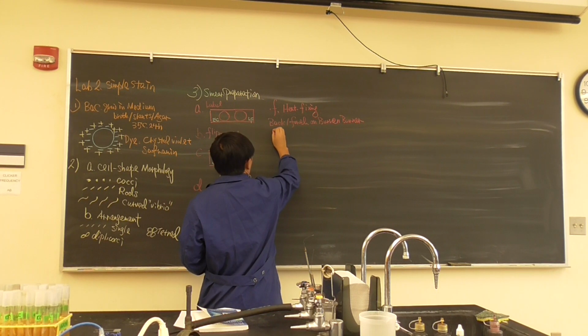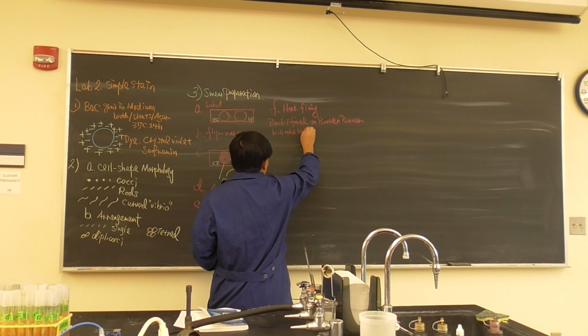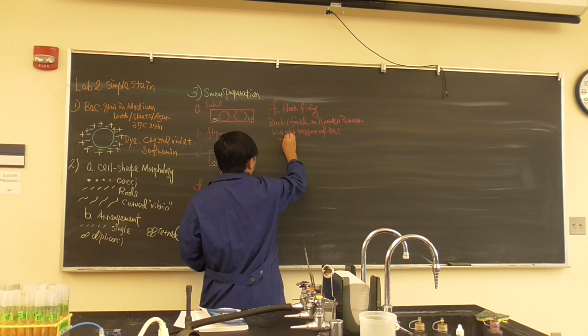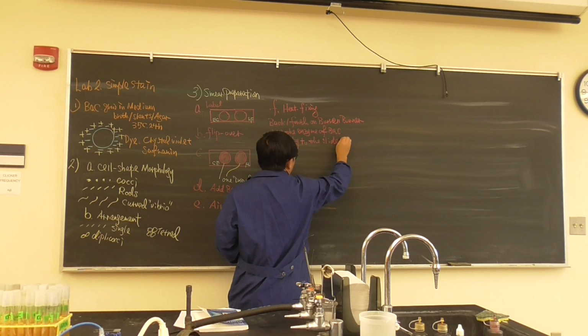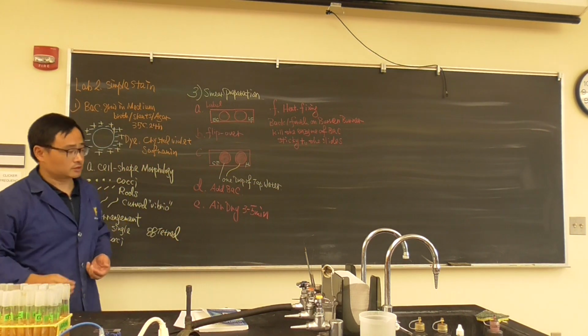We're going to have to kill the enzyme or bacteria and make them stick to the slides. That's called heat fixing. Okay, back and forth a couple of times.